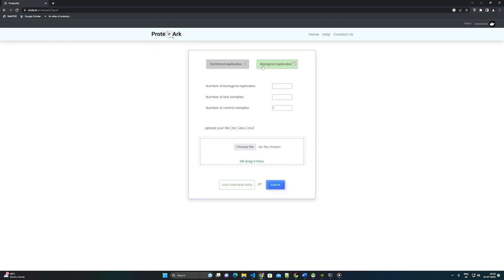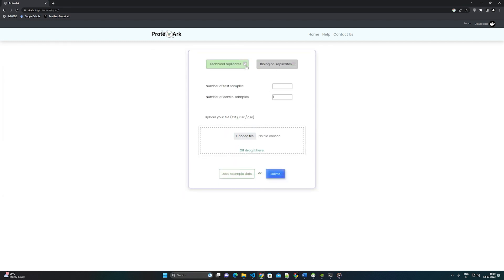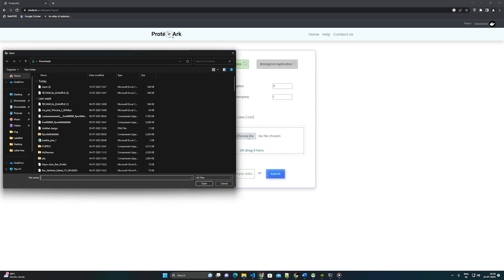Input data type: technical or biological replicate. Step 3: Provide the details on the number of test samples, control, and biological replicates of user data.